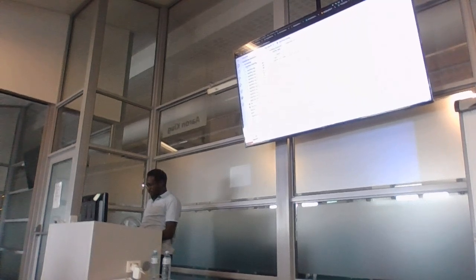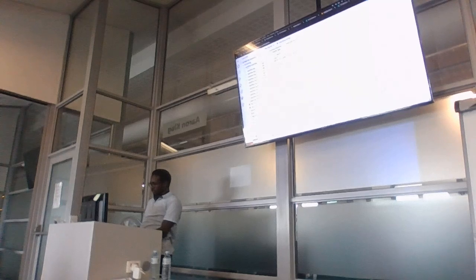Let's see it in one of these. But what I mean is if you put it above the fastp, because that's the actual shell script that we're looking at, right? Yeah, but if you put set minus x, do you actually see what's going on with the shell script when you run it? Yeah, we can. Because there's a file in the work directory, right, that captures the standard out. If I remember correctly.